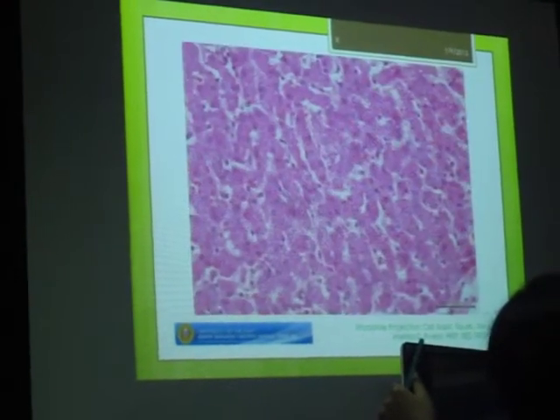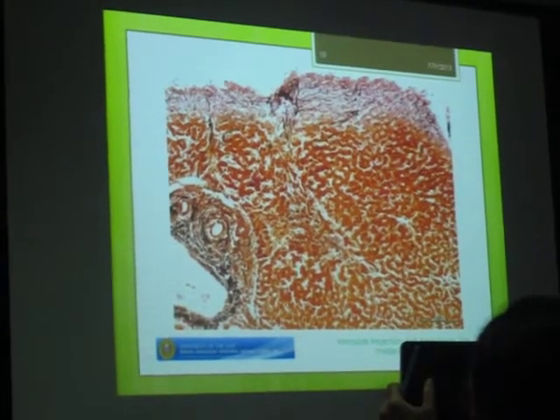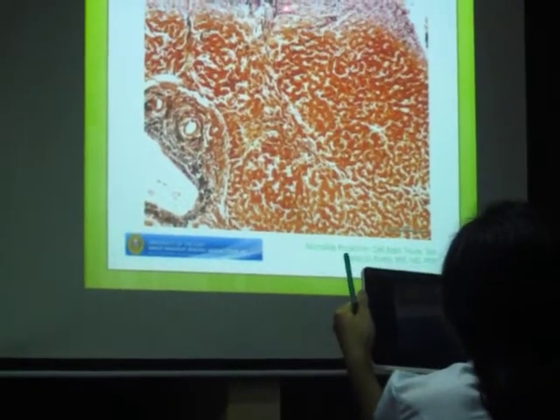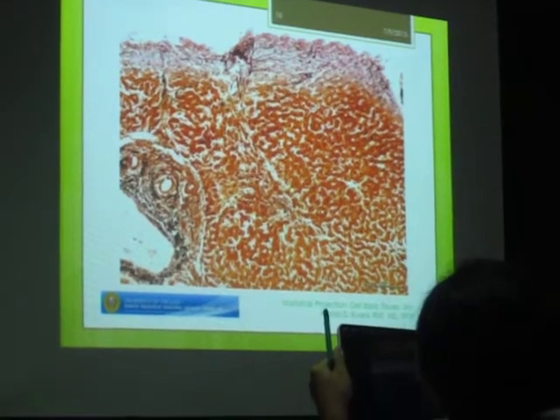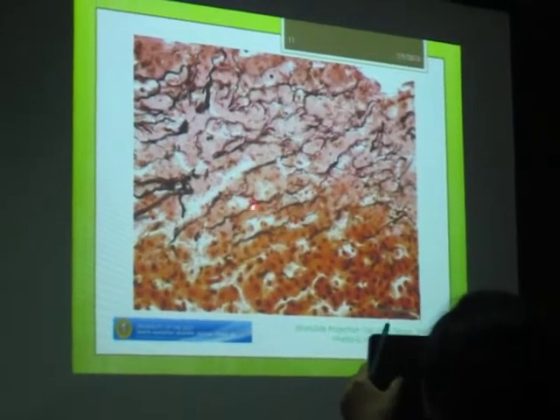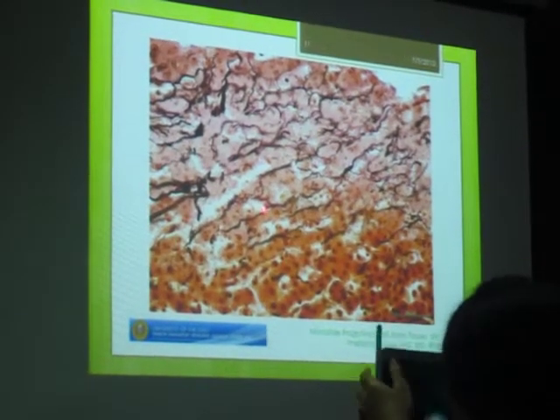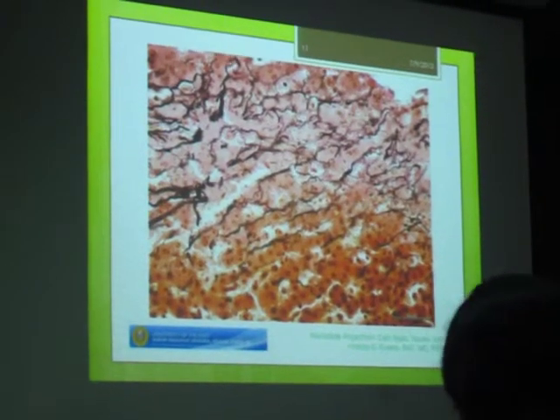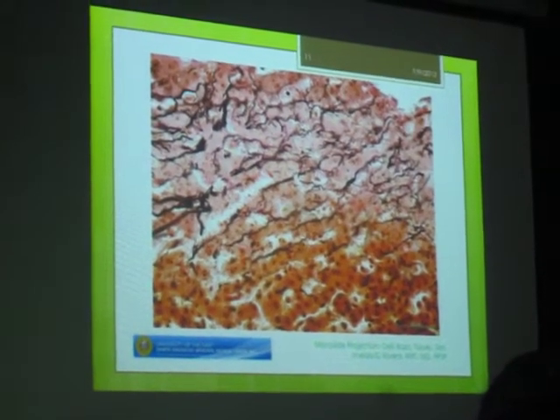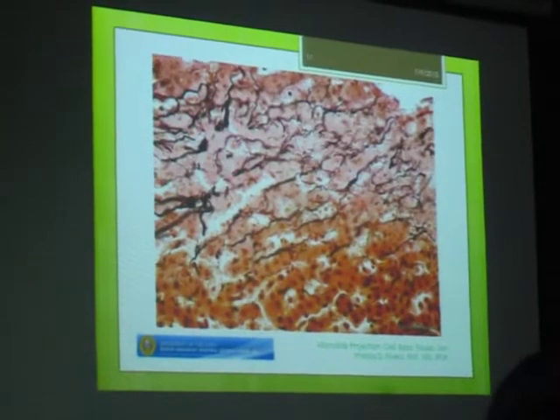Okay, why do you have to stain it with silver stain? To emphasize what structure? What are these hair-like black lines? These are reticular fibers. So, if the pointer is pointed at this and the question is identify the pointed structure, your answer is reticular fiber.